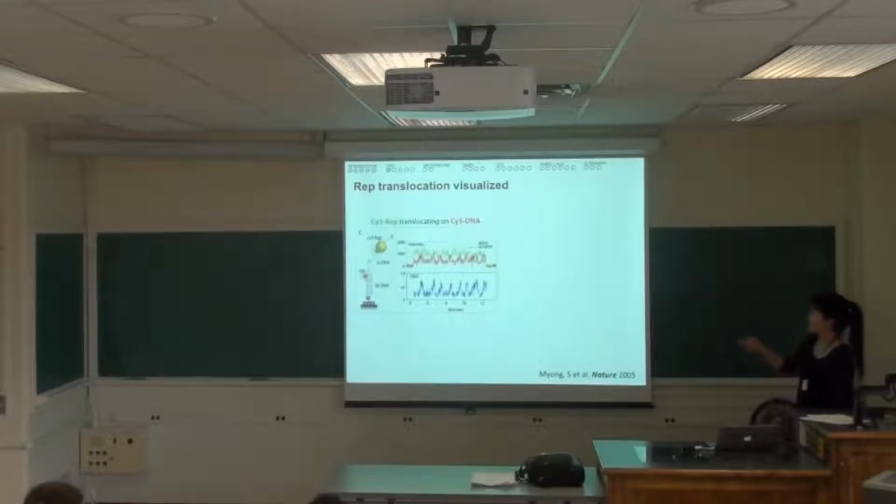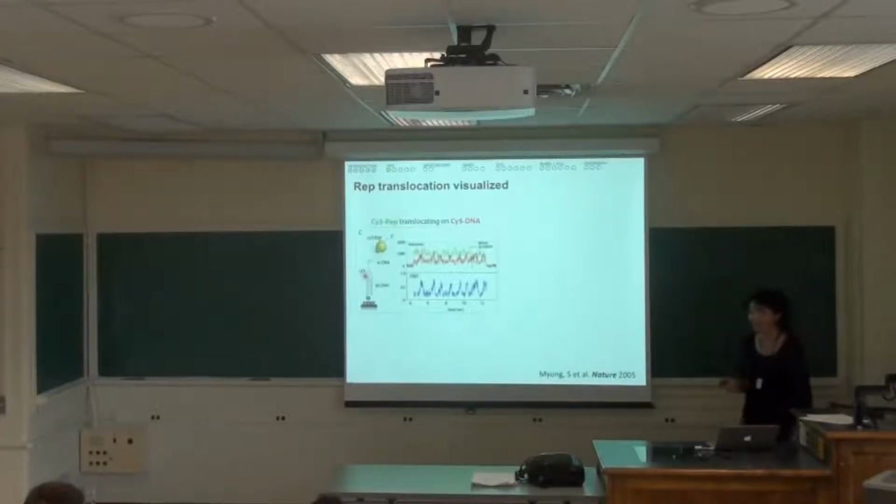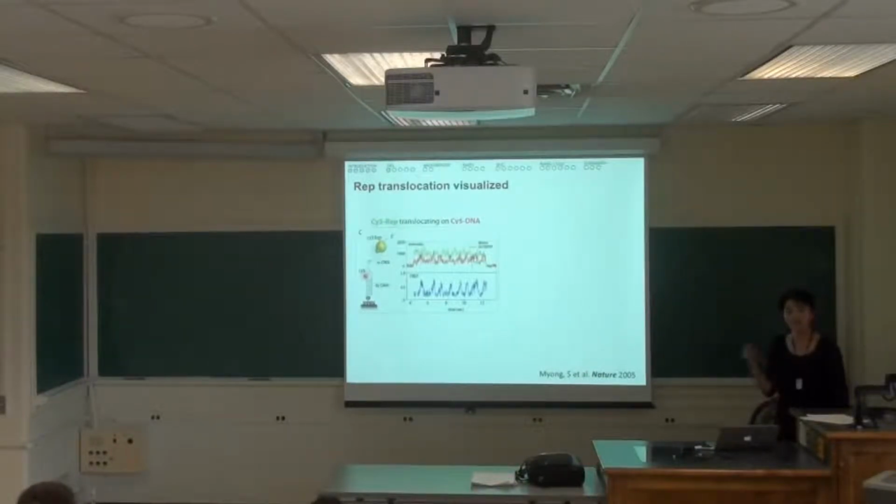But it was here, as you can see, I'm moving on to the next topic. So this is what we can do with FRET. It's a lot of fun. In the microscope room, basically you're seeing this kind of seesawing sets of molecules everywhere, and it's very much like a planetarium kind of experience because you're looking at fluorescence going back and forth.